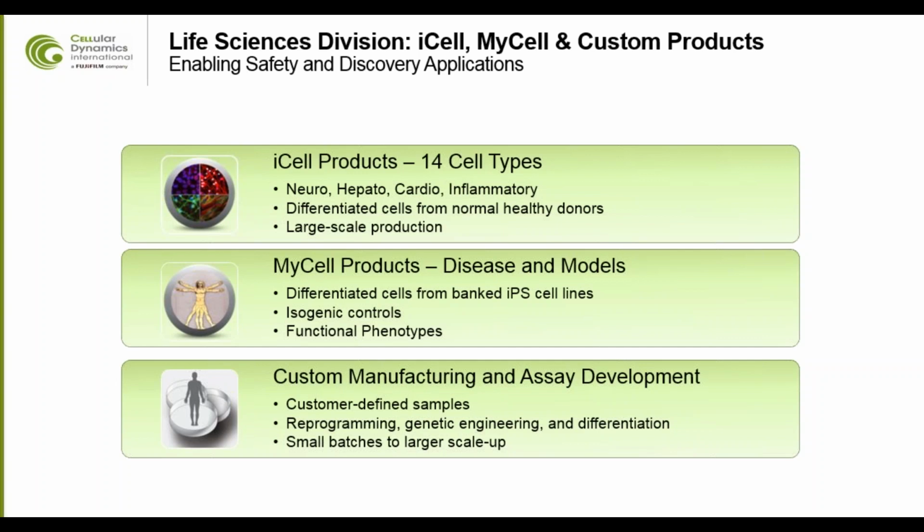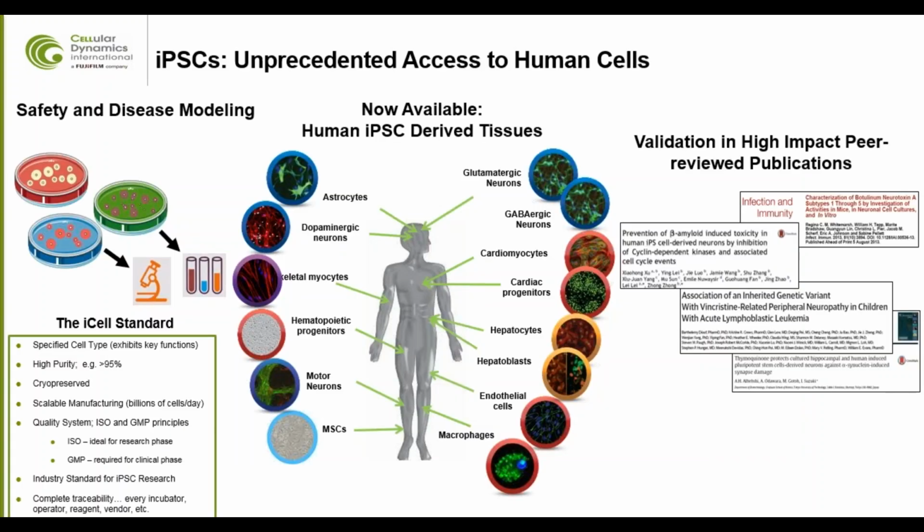And this really takes advantage of the power of iPSC, where you can go to targeted populations and generate that research material. So whether it's looking at differences among different genders or populations, clinical populations, or disease types, you're able to make that translation and make that leap and use that broad base of cellular material from actual relevant populations.